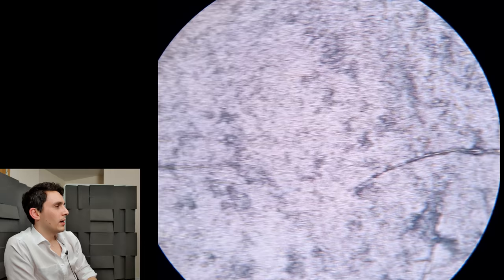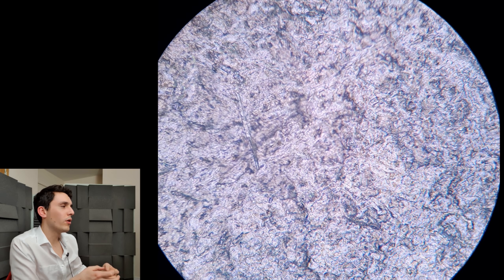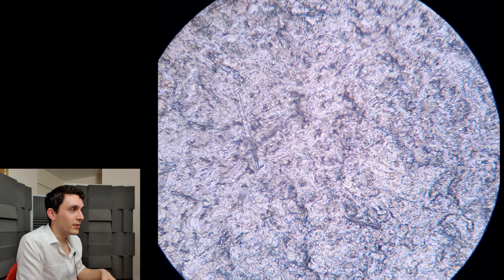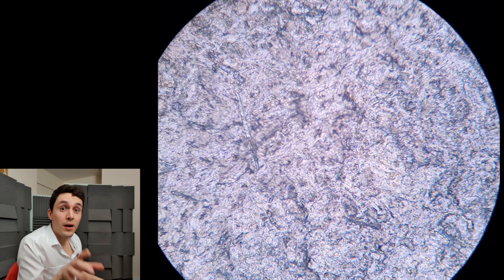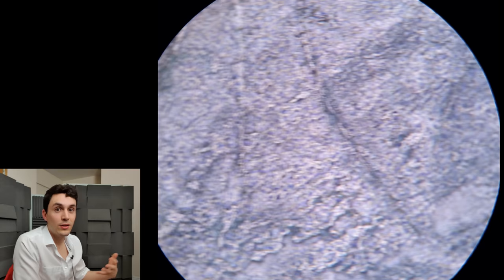At the beginning of this examination, I just looked at the thicker parts of the slide to see if I could see anything. Here you can kind of see these little filaments. Now, because I already know what's on the slide, it's really super obvious to me what I'm looking at. But it will also become obvious to you by the end of the video, and then you can rewind and see what I'm seeing. It's kind of like a puzzle — once you know what you're looking for, it becomes really obvious.